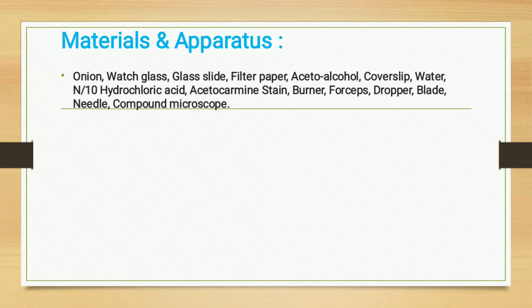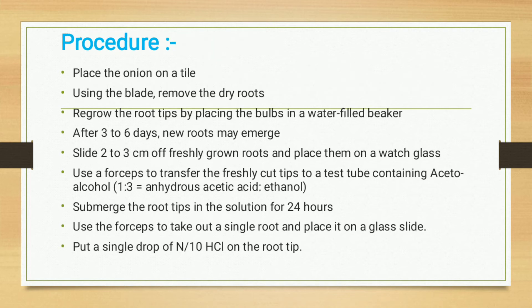For the temporary preparation, the procedure is as follows. First, place the onion on a tile and use a blade to remove the dry roots. Regrow the root tips by placing the bulb in a water-filled beaker. After three to six days, new roots may emerge. Cut two to three centimeters of freshly grown roots and place them on a watch glass.